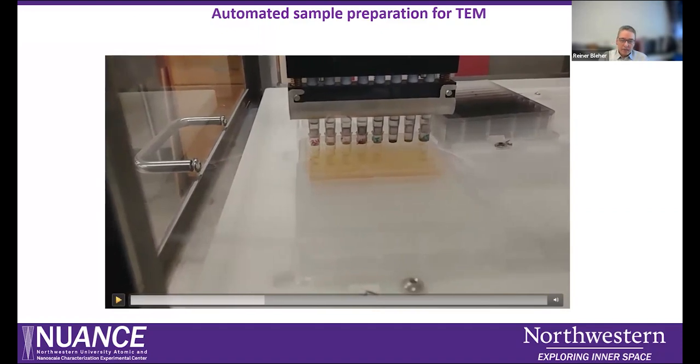And we can adjust, as we had said before, the volume, the speed, and whether there is a stop in between. This makes it clear that this is a very efficient way to exchange liquids in a sample. It's certainly far more effective than placing a sample in a vial in a solution and letting diffusion do its work.